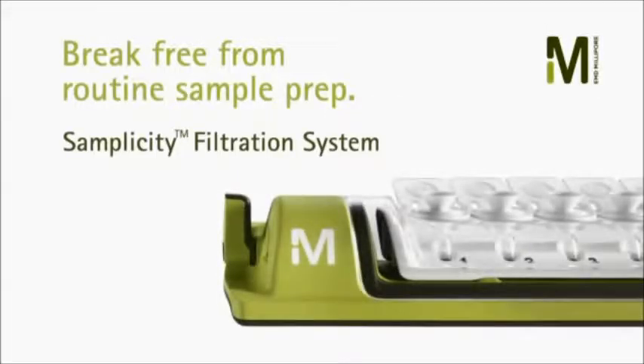We would like to demonstrate the new Simplicity Filtration System, a fast, easy, ergonomic solution for filtering out particulates from samples prior to chromatography.